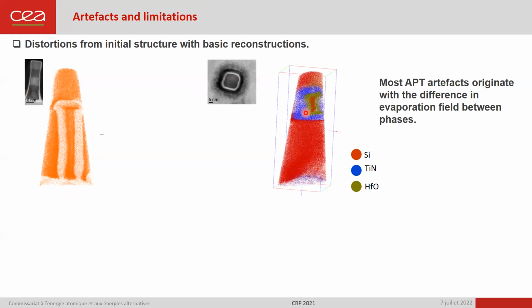And this is the same thing for these devices. So we know that these artifacts are present in devices, and we have to be aware of that, and we have to be very careful for extraction of reliable data.